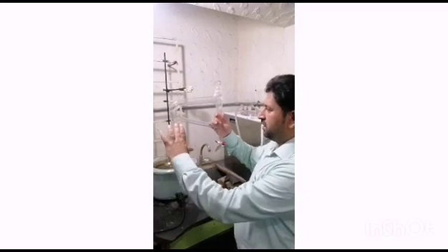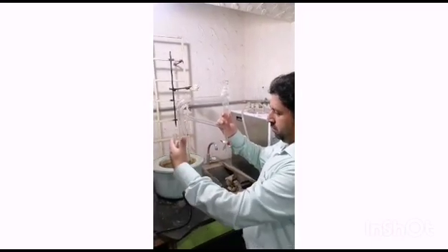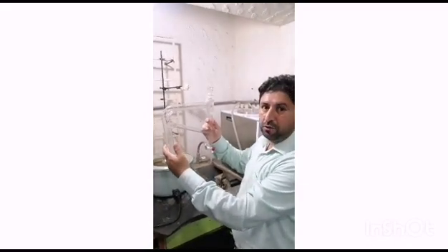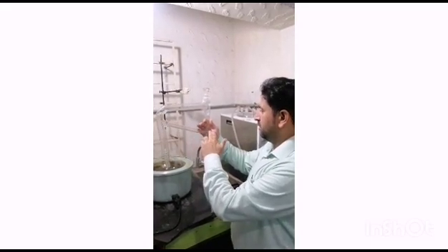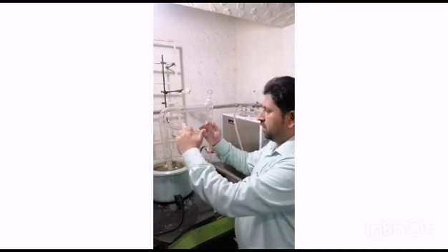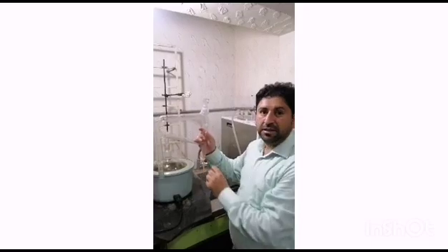This is the Clevenger Apparatus. You can see here — this part here — the oil along with the water, because we are discussing about the hydro distillation process. This will go here and it will collect here. Then this will recycle, and the water will keep recycling, and here there will be a layer of oil — that layer of essential oil.